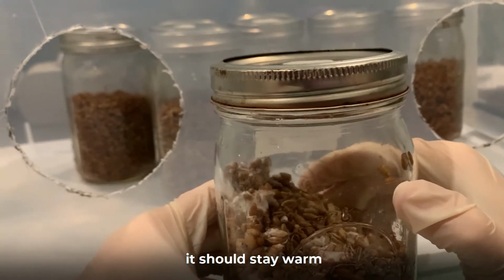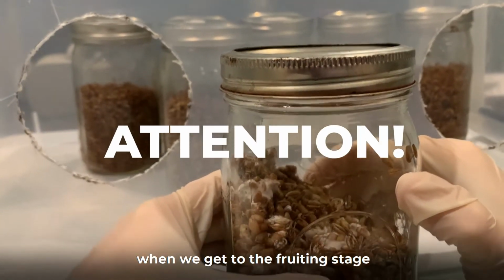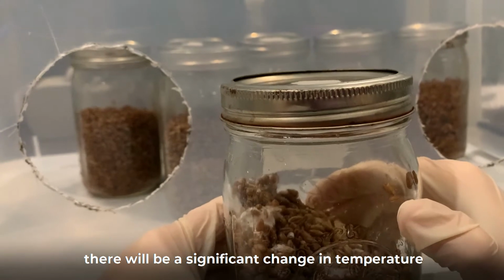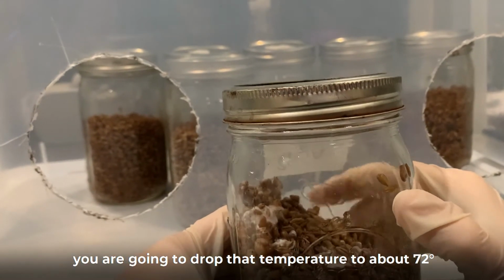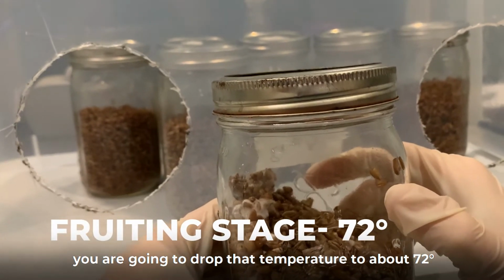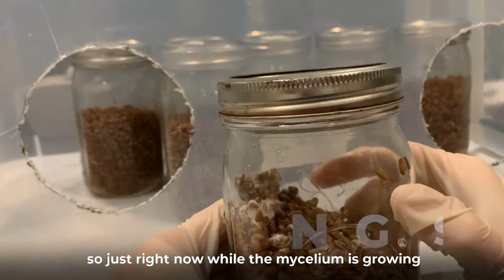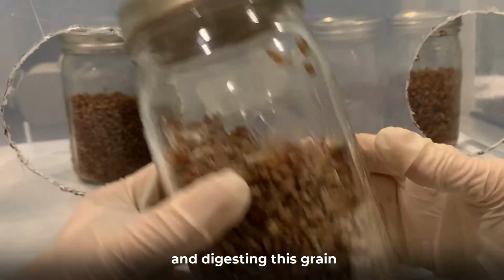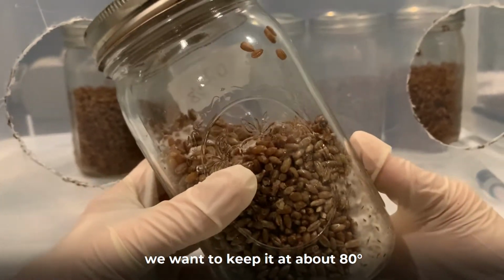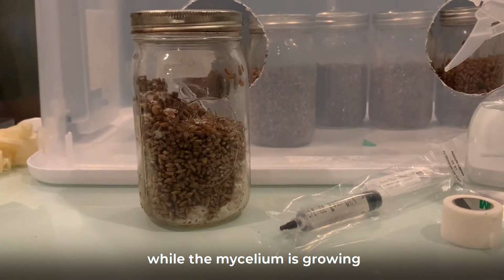It should stay warm. Now, I pay attention to this part because later on, when we get to the fruiting stage, there will be a significant change in temperature. When it comes time to the fruiting stage, you're going to want to drop that temperature down to about 72 degrees. So just right now, while the mycelium is growing and digesting this grain, we want to keep it at about 80 degrees. So let's talk about how to care for these jars while the mycelium is growing.